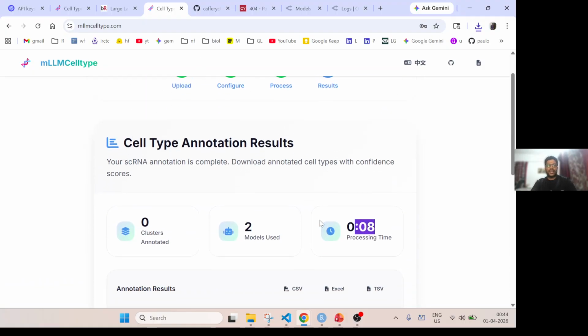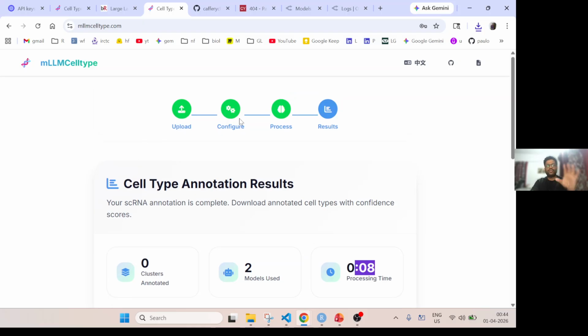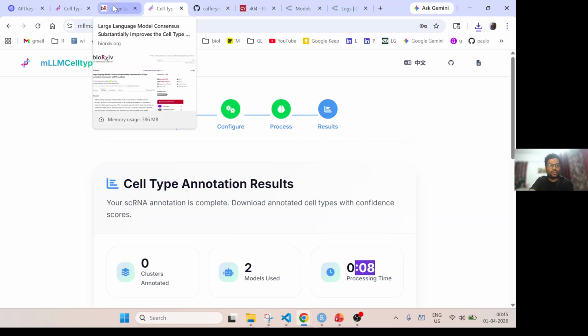Okay, but you get an idea, right? Because when we use an actual model, you will get some results. Very easy interface. You upload the data, just choose what LLM you want, and submit it. So it's all about the money. If you have money, it will work, and you have to pay some money for actual work. But it's very smooth, you see.